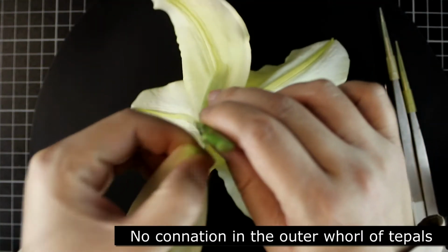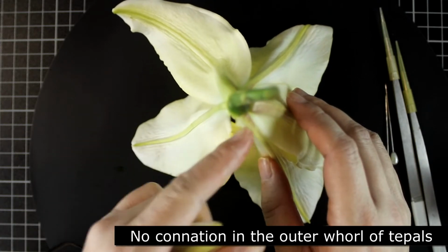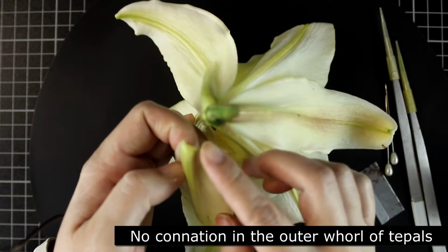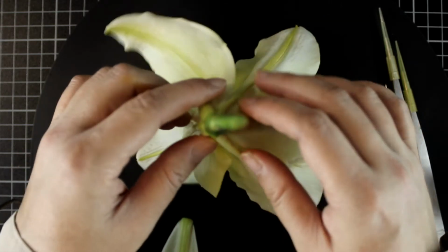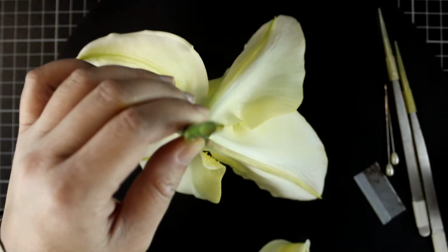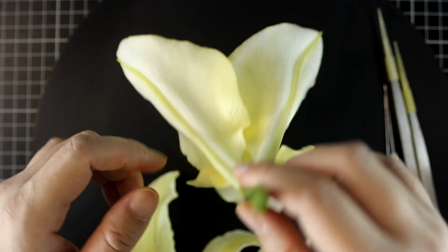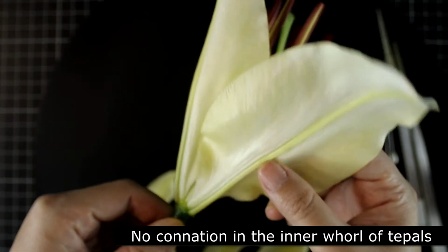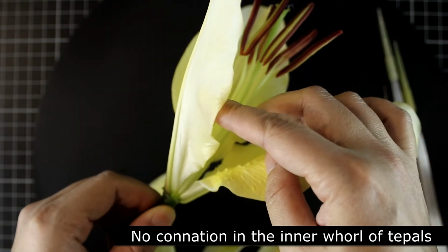So if I remove one tepal, we will find that it won't hurt other tepals because they are not joined at the side. Okay. So I remove 3 of them, the outermost whorl. Okay, so what you can find now is the inner whorl. And in the inner whorl, obviously, the tepals are not fused together. They're well separated too.